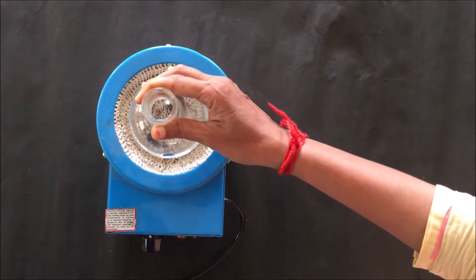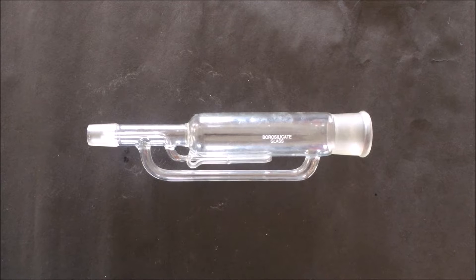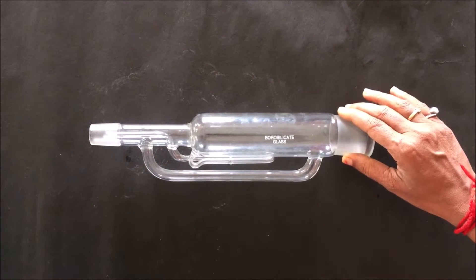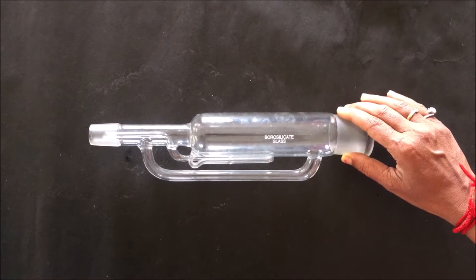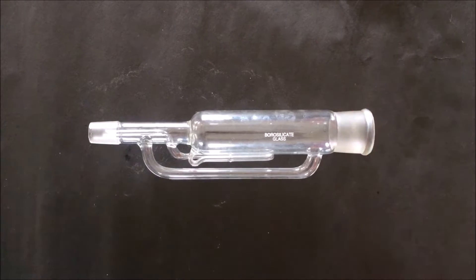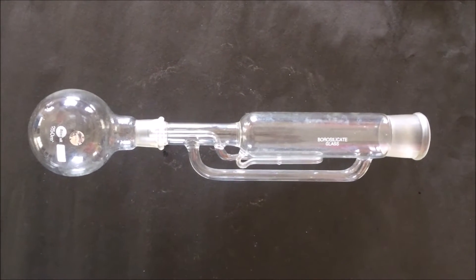This is the heating mantle and this is the round bottom flask. The heating mantle is used to heat the solvent present in the flask. This is the main part of the Soxhlet apparatus called the Soxhlet extraction chamber, where the actual extraction takes place. Inside this chamber the powder drug material is placed. To the joint at the lower end of this chamber we have to attach the round bottom flask.